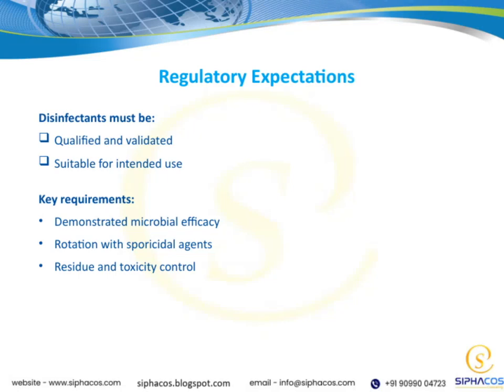Let's take a closer look at regulatory expectations for disinfectants. First, it's essential that disinfectants are both qualified and validated before they are used. This means they need to be thoroughly tested to ensure they work effectively and consistently. Additionally, they must be suitable for their intended use, whether that's cleaning surfaces, equipment, or other areas within a facility. Now, moving to the key requirements, these are critical for compliance and safety. The disinfectant must demonstrate proven microbial efficacy, meaning it effectively kills or inactivates the microorganisms it's supposed to. This is fundamental to maintaining a safe environment.